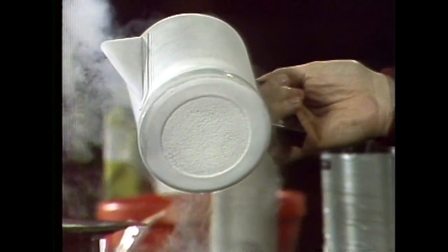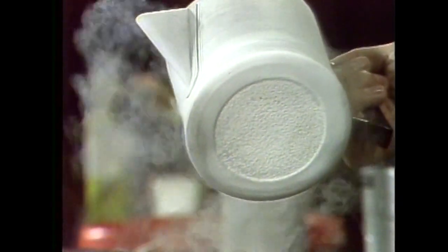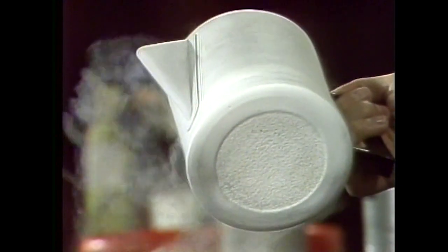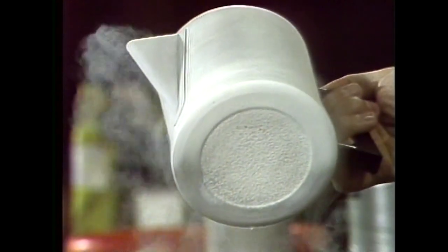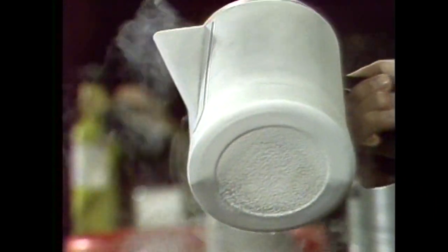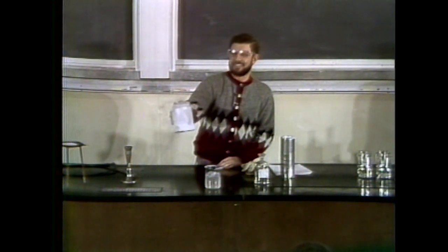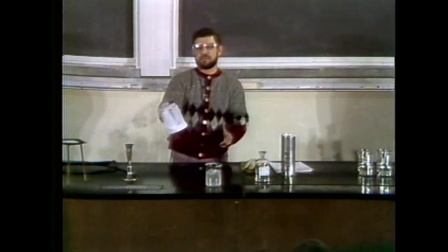And if you look at the bottom of this pot, you see some white material there. And as students who've had now a semester of chemistry, I'm fairly confident you can tell me what this material is. Would anyone want to venture? It's a white substance, right? Now just think of what we're doing.